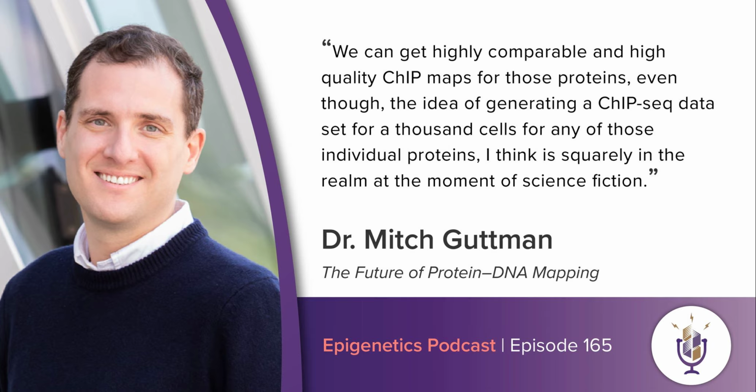You already went into the details of the problems, but I guess it would be good if you could just give us a walkthrough of the ChIP-dip workflow.